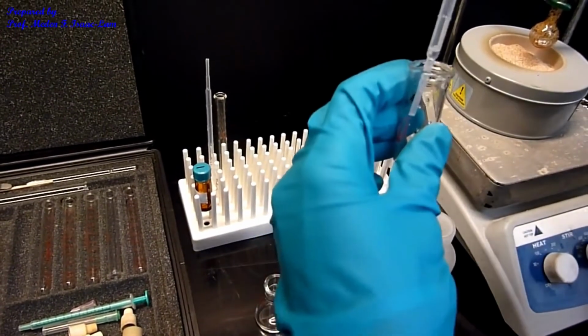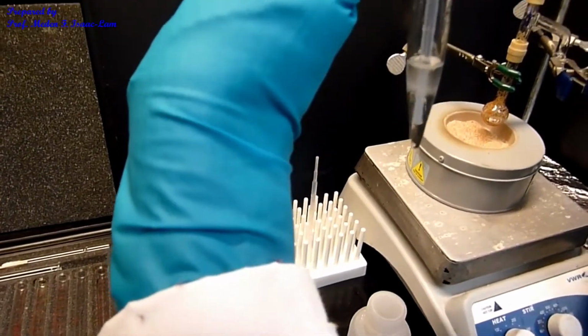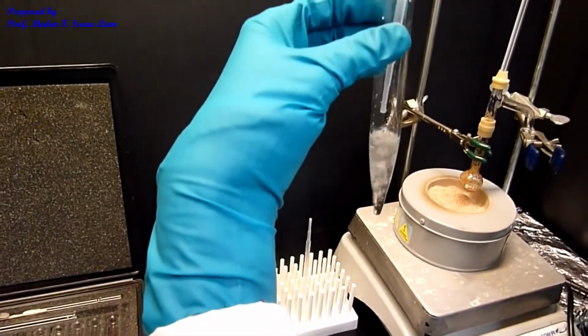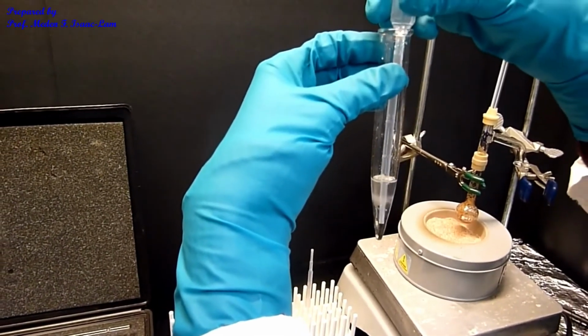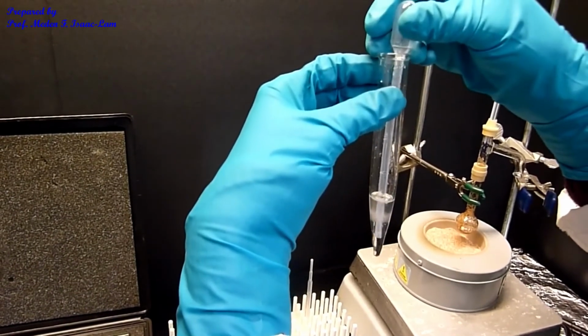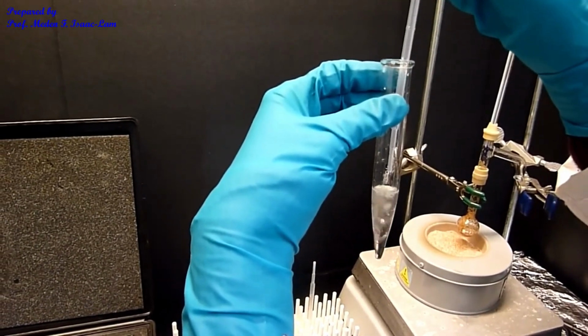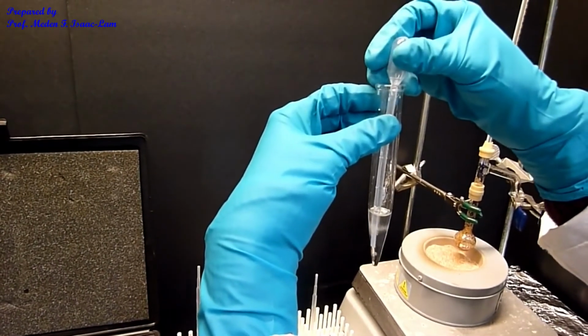So I'm going to use this to pipette up and down and to shake it. There's some fizzing going on. Now it's stopped. The sodium bicarbonate is basic. If there's any acid, it will neutralize it.